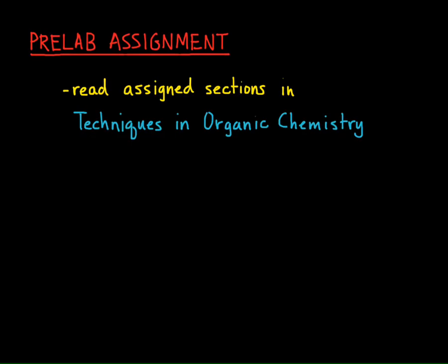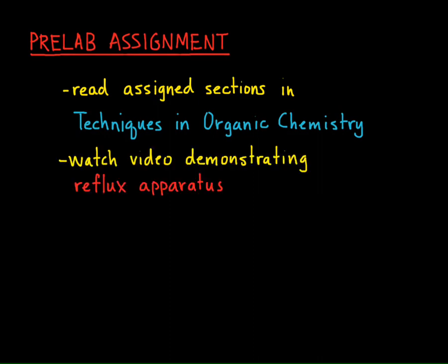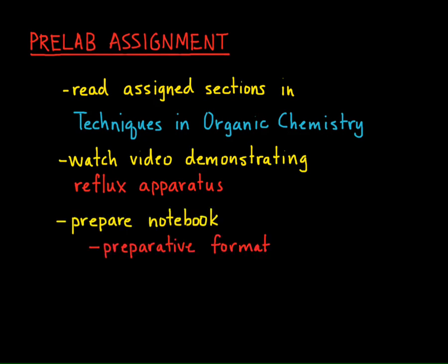Your assignment for this experiment consists of reading the assigned sections from the Techniques in Organic Chemistry and watching the demonstration video on the reflux apparatus found on the W.H. Freeman website under Williamson Movies. Since refluxing is a new technique you will encounter in this experiment, this video will show you how to assemble the reflux apparatus. Lastly, you will prepare your notebook using the preparative format, making sure that you use only your assigned alcohol.